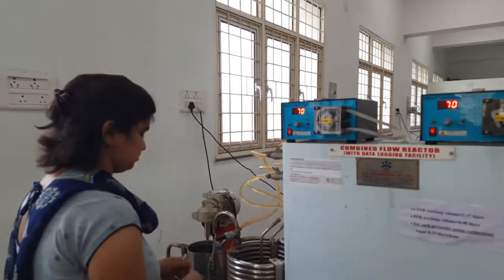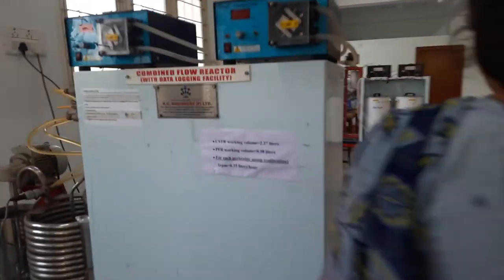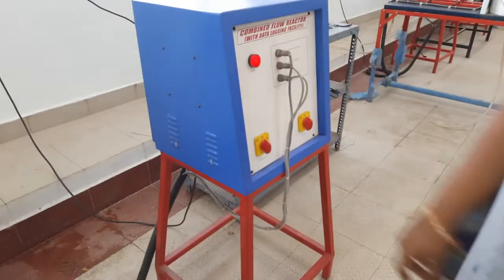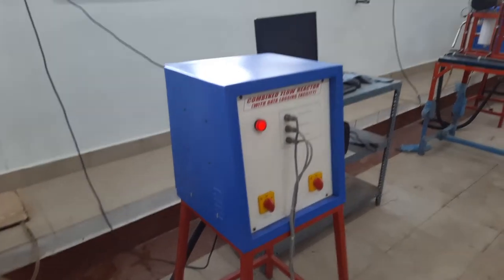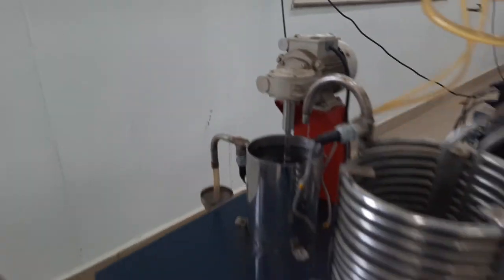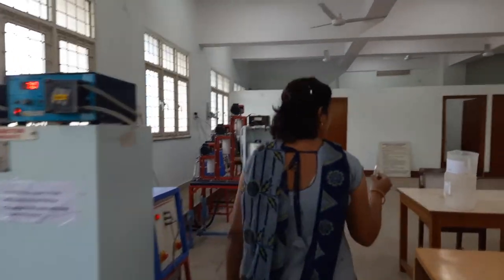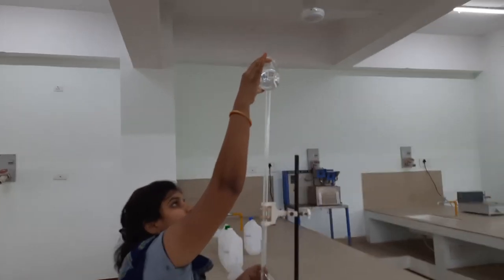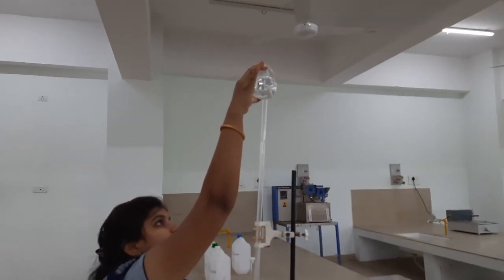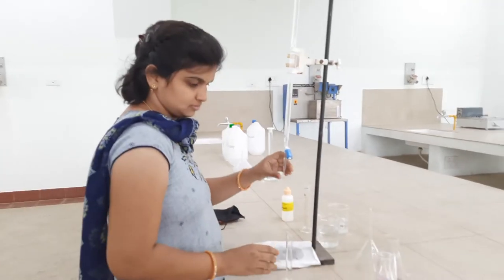Before doing the titration, we will switch off peristaltic pump 1 and 2 and switch off the main switch also. Then go to perform the titration. Take 10 ml and titrate it using the HCl solution. Refill the burette with 0.05 normal NaOH up to the zero level.